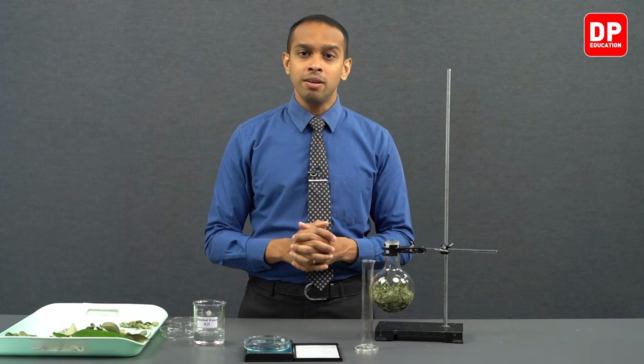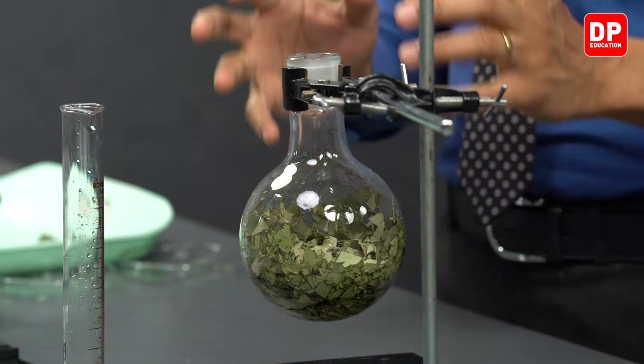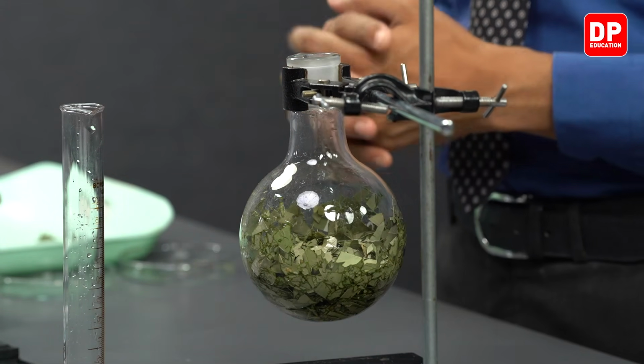Now you may wonder why we use this particular setup to carry out our oil extraction. As you know, some volatiles or some essential oils that we have in different natural sources have a somewhat high boiling point.